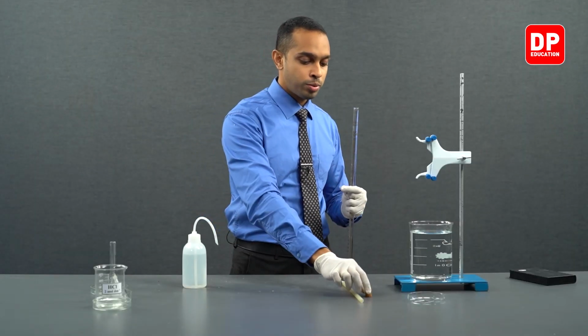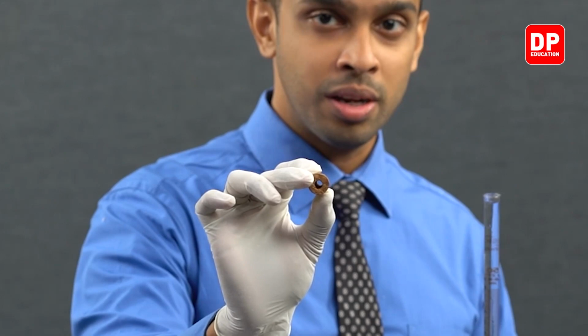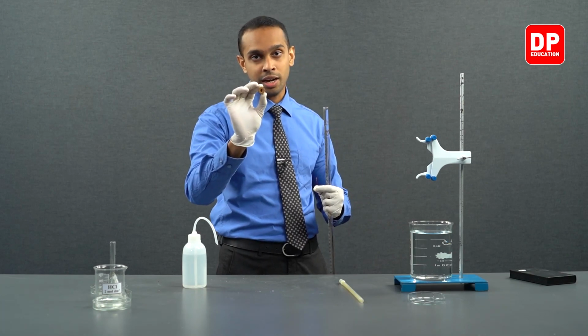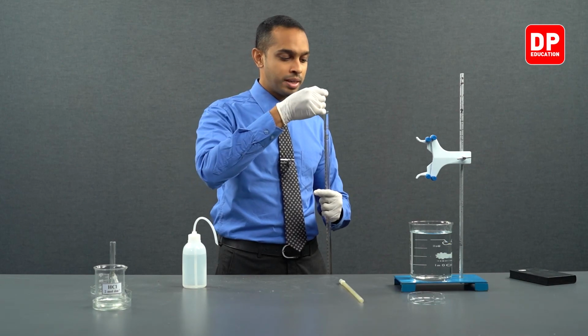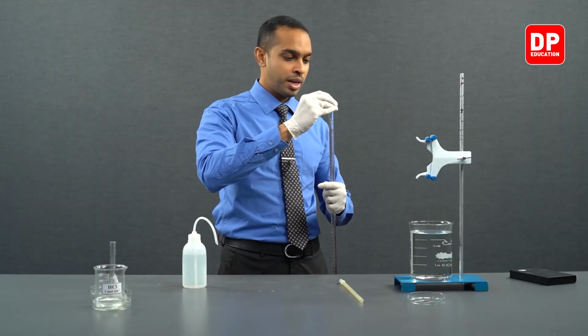Now, if you observe clearly, the cork that we are going to be using has a hole in the middle so that it allows the water to get removed from the burette when we are collecting hydrogen through downward displacement of water. Now, let's insert this magnesium strip into our burette. As you can see, there is still no reaction happening. We do not see any air bubbles being formed here. So that means we have successfully added the water without mixing it much with HCl.